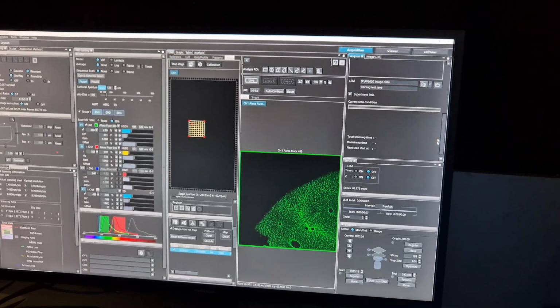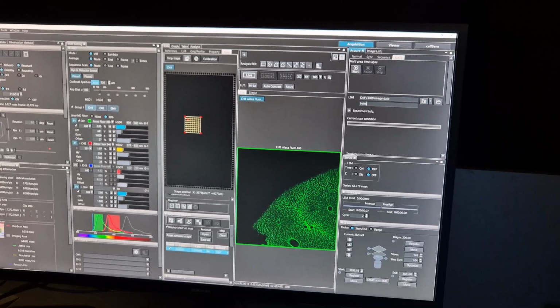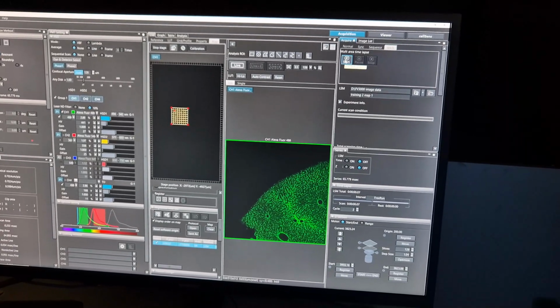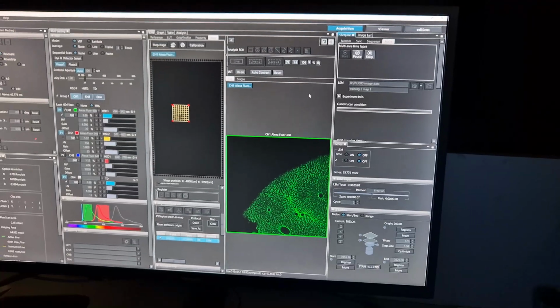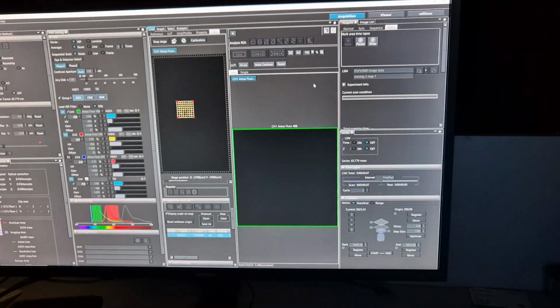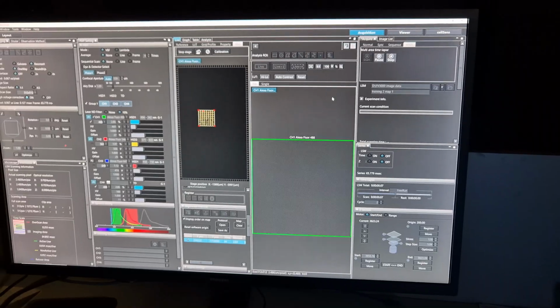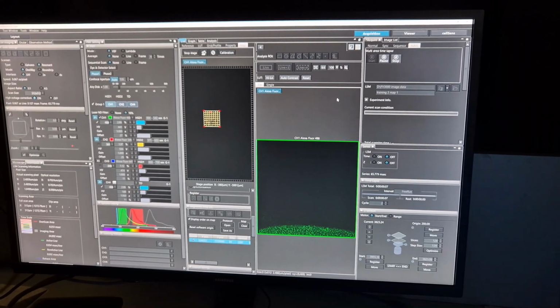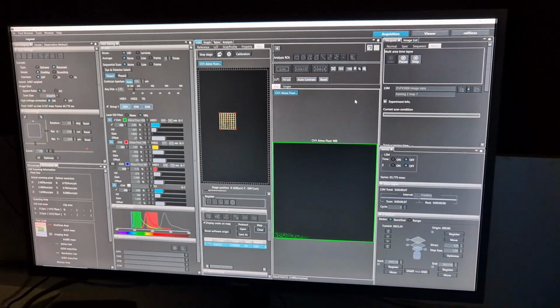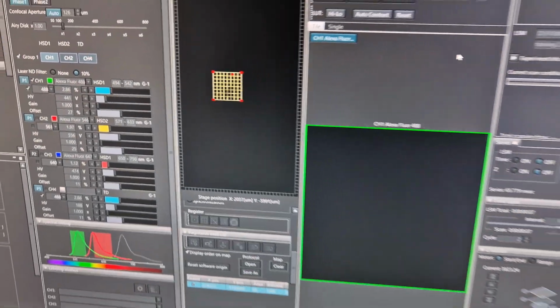And so I'm ready to apply this map now. And start. So it's building from the bottom, like the first squares. And yeah, if we were on a 1.25x or a 2x, we'd probably be done by now. Which is why it's so advantageous to have a low mag.